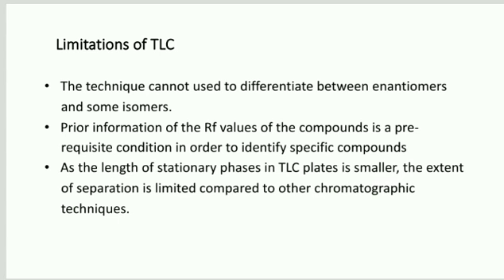Limitations of TLC. The technique cannot be used to differentiate between enantiomers and some isomers. Prior information of the Rf values of the compounds is a prerequisite in order to identify specific compounds. As the length of the stationary phase in a TLC plate is smaller, the extent of separation is limited compared to other chromatographic techniques.